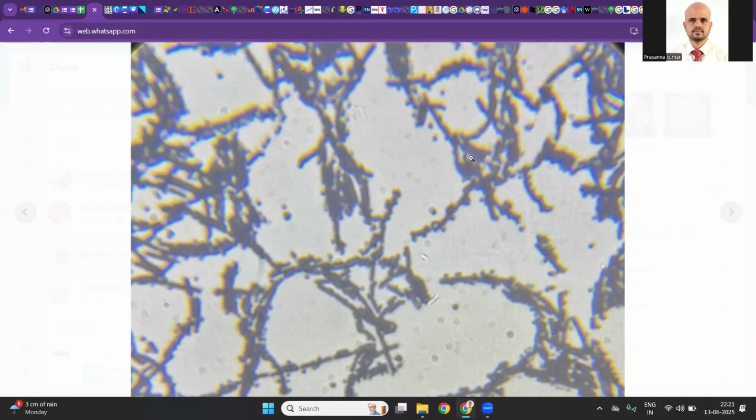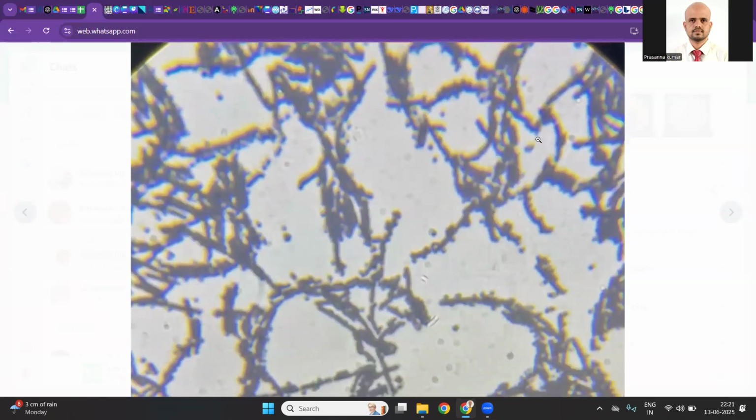You see the hallmark of actinobacteria, because they produce submerged mycelia, and when they want to produce aerial mycelia, they will decay themselves. They will degrade their submerged mycelia, produce antibiotics, then start building aerial mycelia. So they will have a filamentous-like structure. That's why when these organisms were discovered for the first time, they were called actinomycetes for a long time, until Carl Woese's classification and many other people proved that their 16S rRNA sequences closely resemble bacteria. So now, we know it's a prokaryotic organism.